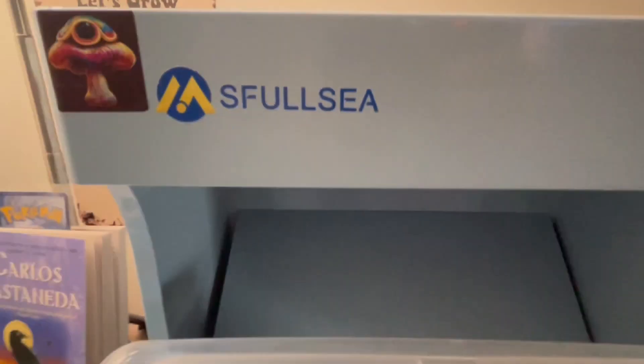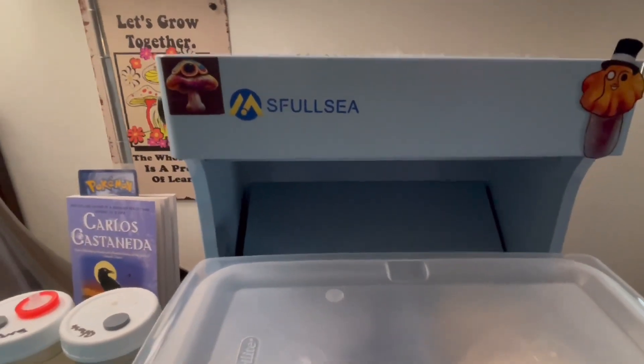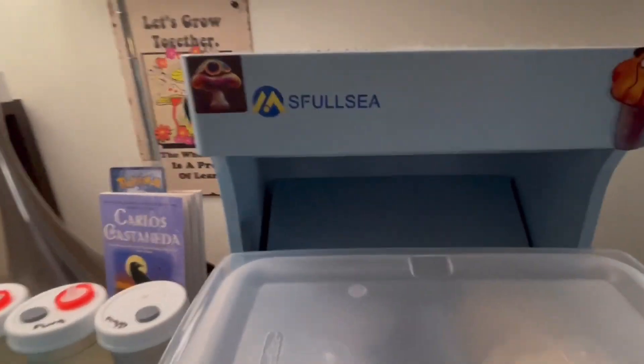I got this in January 2023 and it's all I've used for all my work. I don't really have a thousand dollars for a flow hood, especially being so new in the game. But the MSFullsea is one I would definitely recommend if you're new. Let me turn this on.